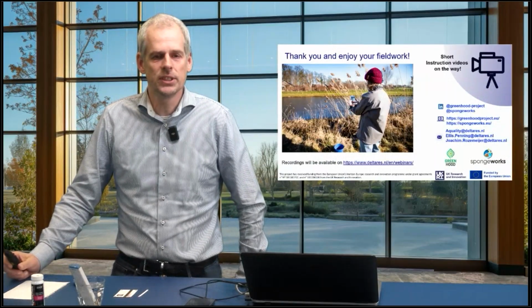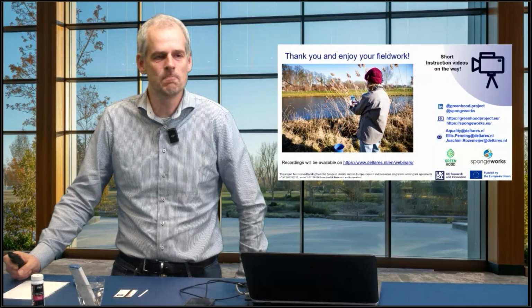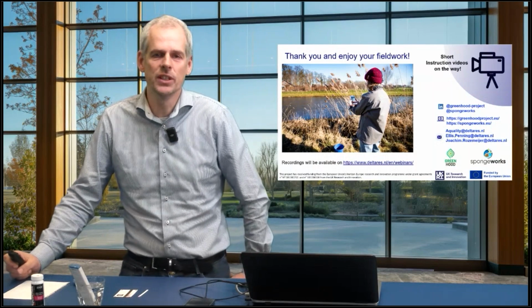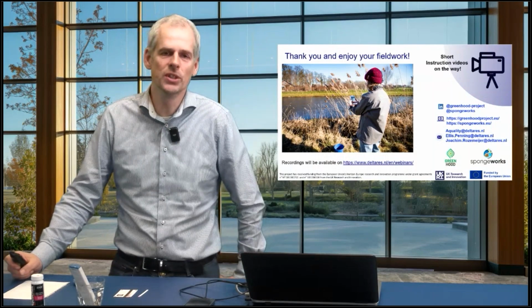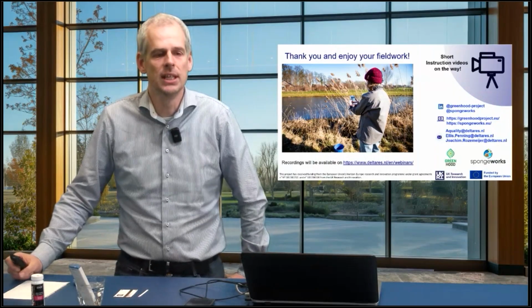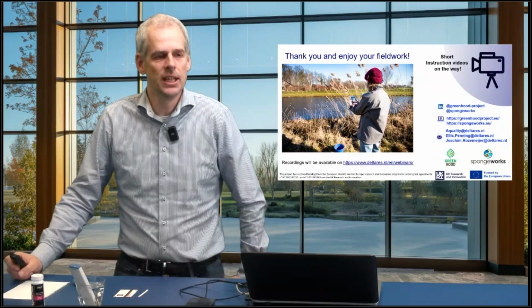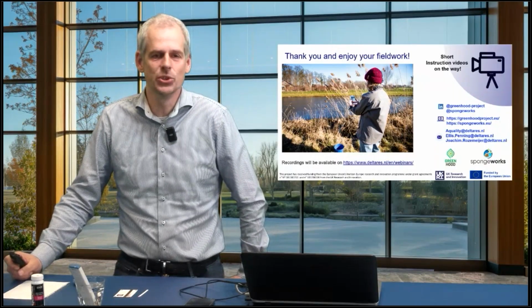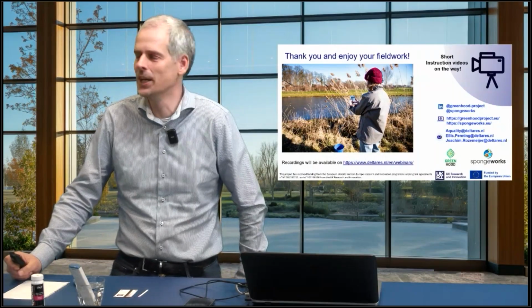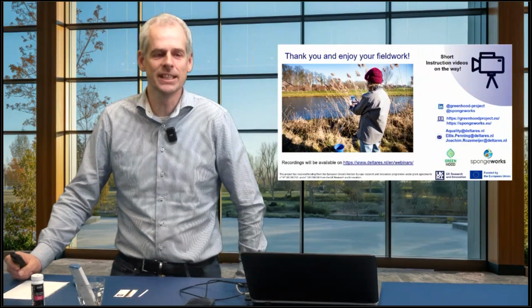Okay, these were our adventures and our examples. We wanted to say that we are still making some really short instruction videos that will be coming on our website soon. There are some links here and email addresses that you can use. And most important is to get the supplies and try it, and go out. We want to wish you a lot of pleasure doing that.